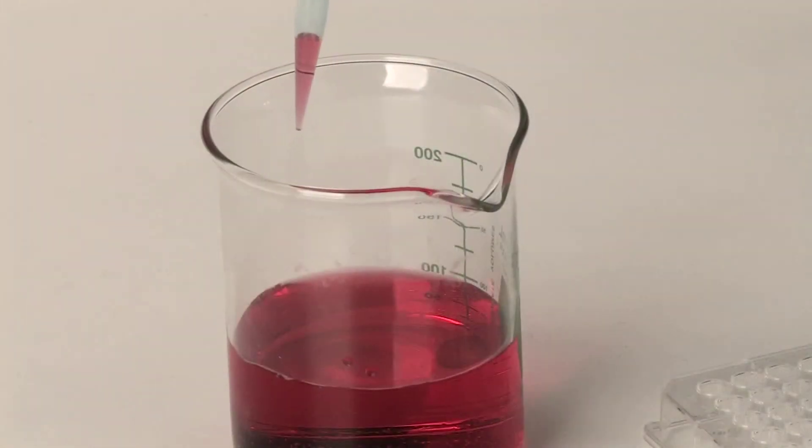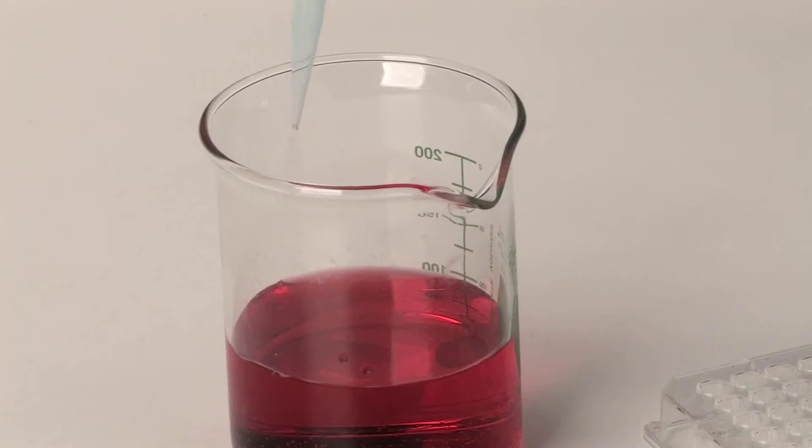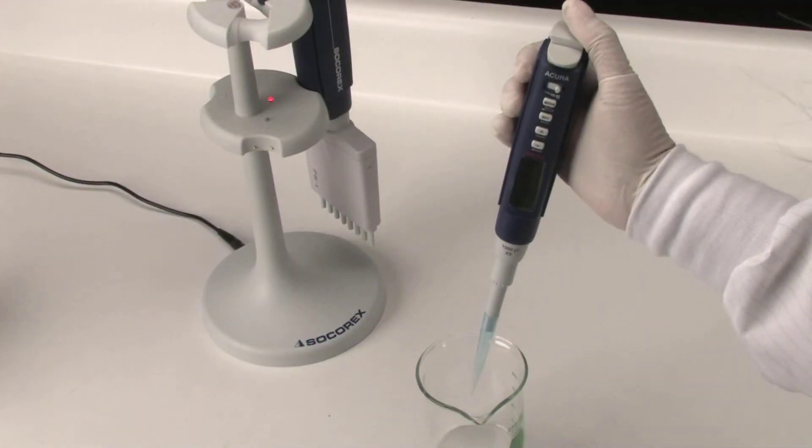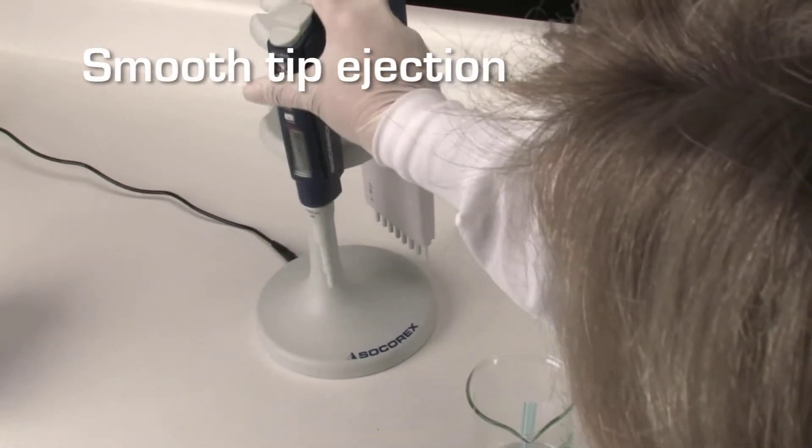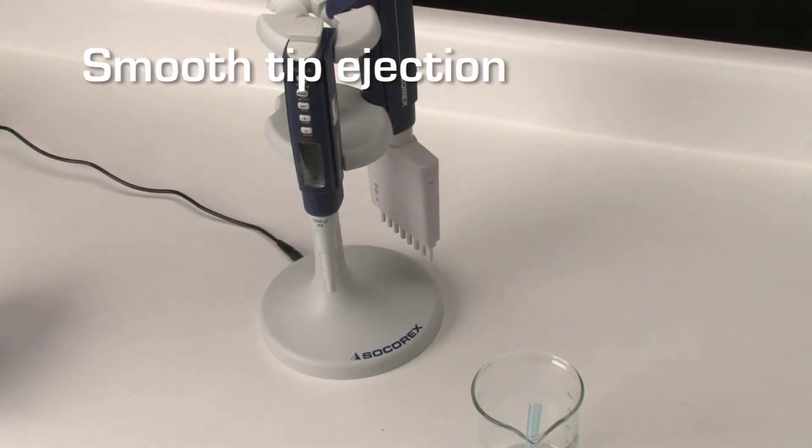Display shows purge. A double click expels the remaining liquid in the tip. Once dispensing is complete, the tip can be easily ejected by pressing the large, ergonomically located button.